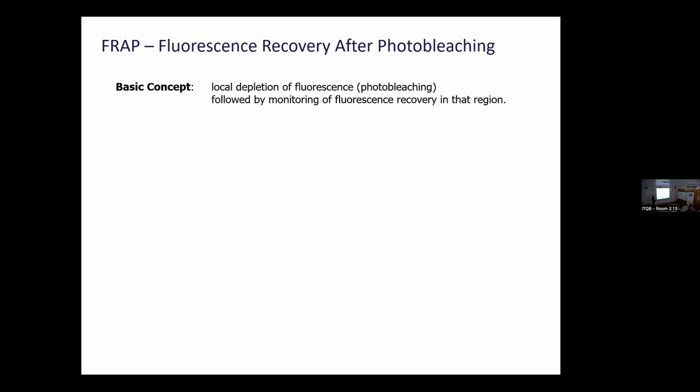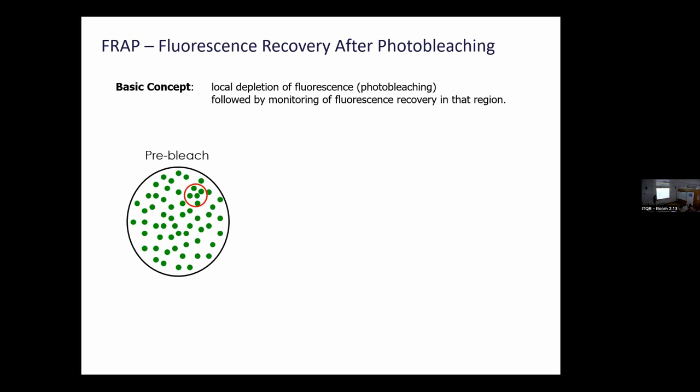The basic idea is to use photobleaching in a controlled way. So this is a slide from Zerbergen many years ago. Let's assume that this is a cell or a nucleus full of fluorescently labeled proteins that we are imaging with very, very low light intensity. We can control the laser very, very fast, in microseconds. So we can say, scan with 0.1% here, here, here, but inside this region change to 100%. And we can photobleach just this area with a very high intensity laser, specifically there.